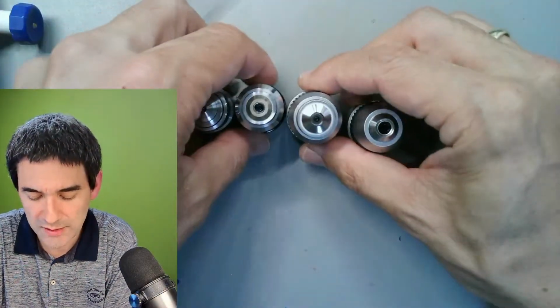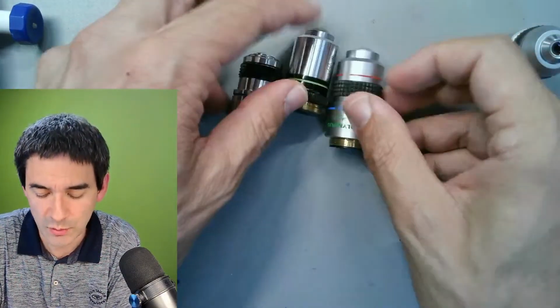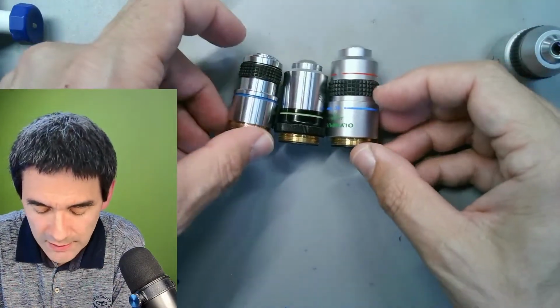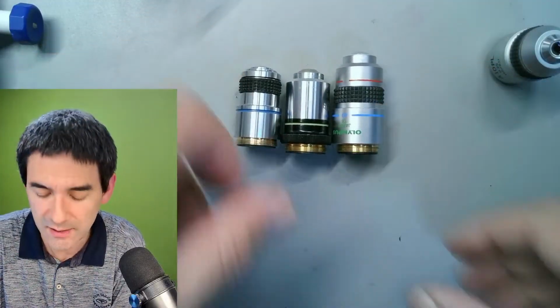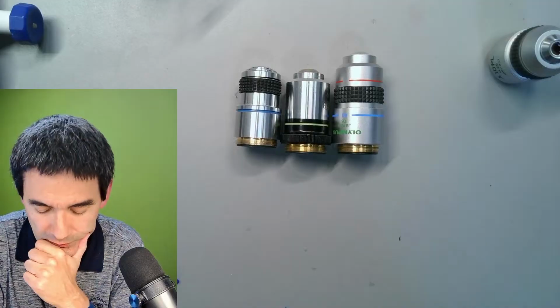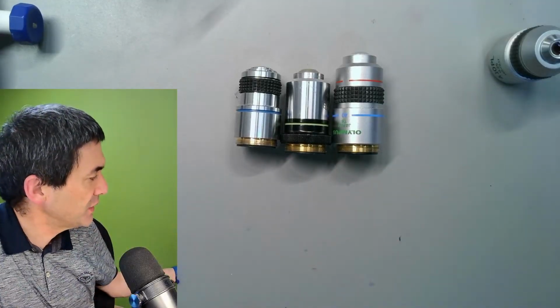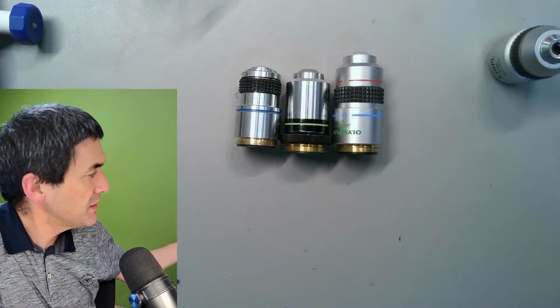So the question is now the following. Let's just compare those. All of them have the same magnification. What in the world is going on here? Why do they have a different size? And can I now exchange them? All of them have a tube length of 160. What does this mean? This basically means the following.